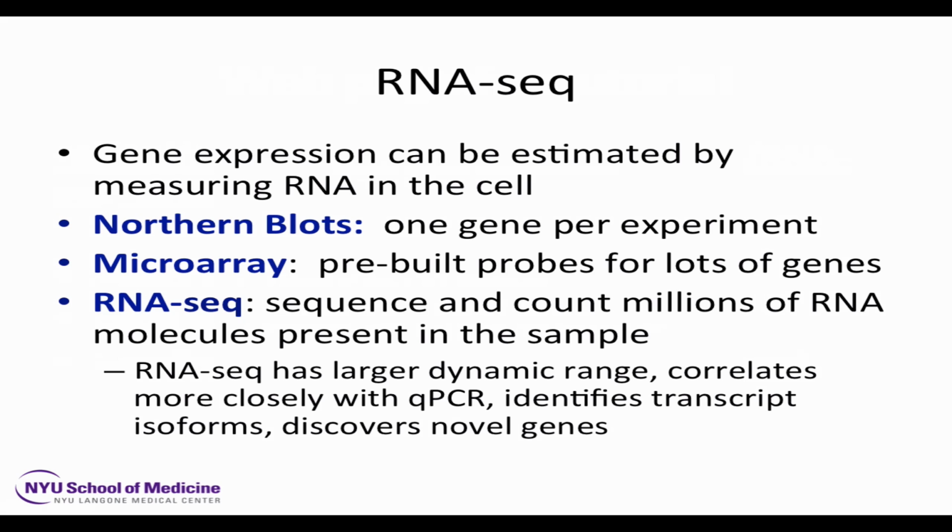RNA-Seq is considered superior to microarrays, which is probably why all of you are sitting here, because it has a broader dynamic range. You can measure differences between highly expressed genes more accurately rather than hitting a plateau. It's more sensitive. You can measure genes that are expressed at a lower level, sort of at a background or hard to measure accurately level by hybridization.